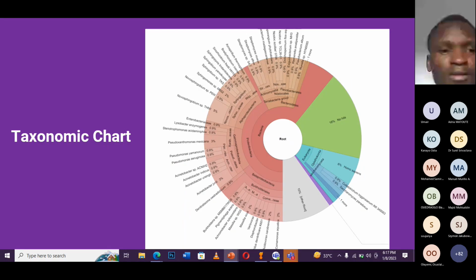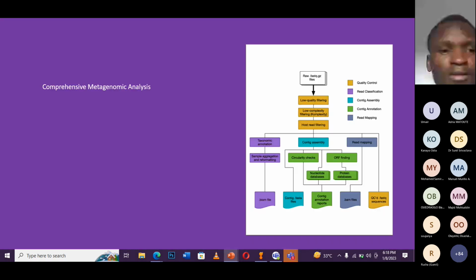We can know the virulence factors and resistance genes in the metagenome, sir? Yeah, you can know that in metagenome. You can also know that in whole genome, but when you do that for whole genome, it is only for that bacteria. When you do it for a metagenomic sample, it is associated with the entire bacterial community or multiple specific bacteria present in that region. Okay, now clear. Thank you.